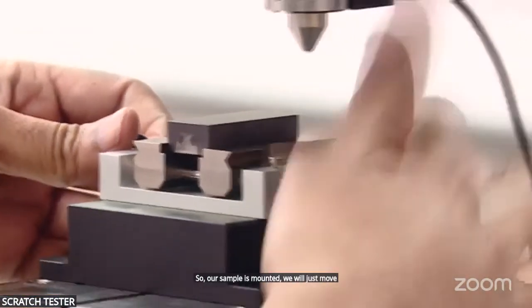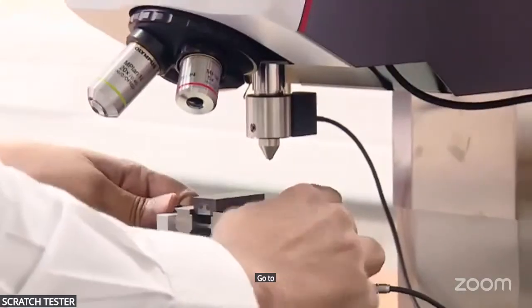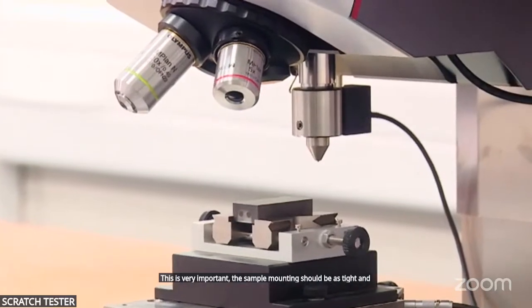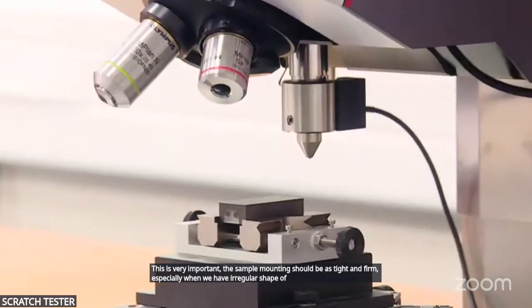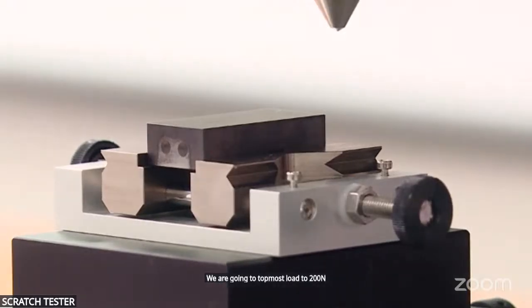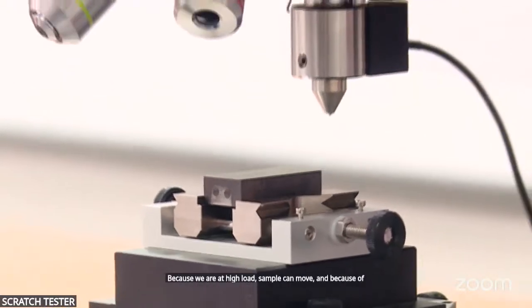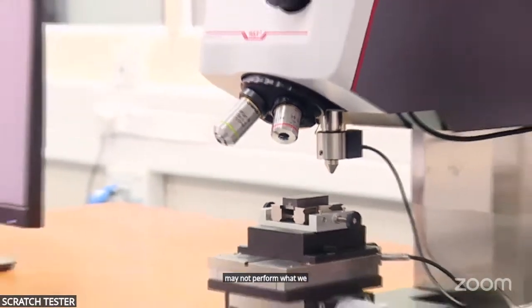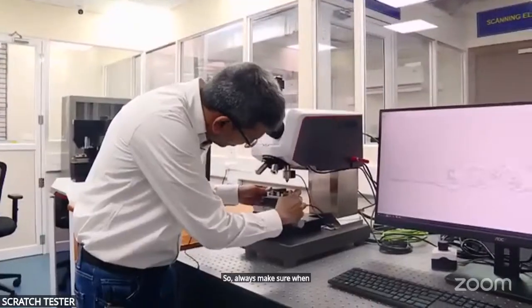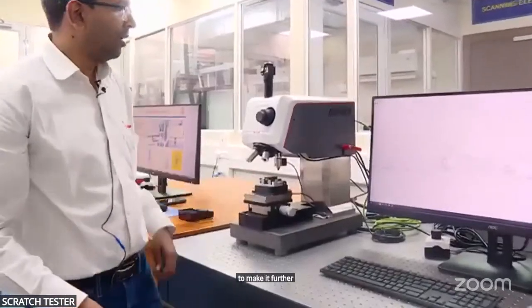We will just tighten this screw to make doubly sure that nothing moves when we go to high loads. This is very important. The sample mounting should be tight and firm, especially when we have an irregular shape of sample, because we are going to a topmost load of 200 Newton. If it's not properly fixed, because we are at high load, the sample can move, and because of that our measurement may not perform as we want. It can get tilted at those high angles. So always make sure when we are doing the measurement it's properly tightened, and that's why we have a small screw here to secure it further.